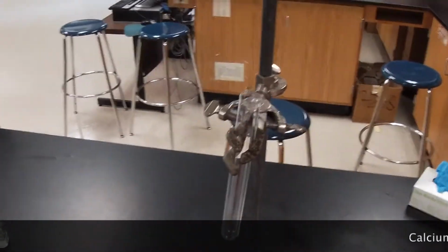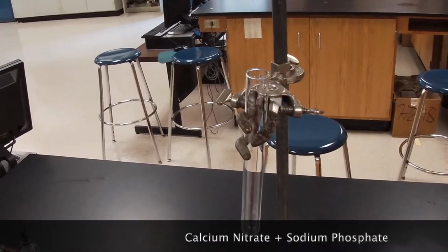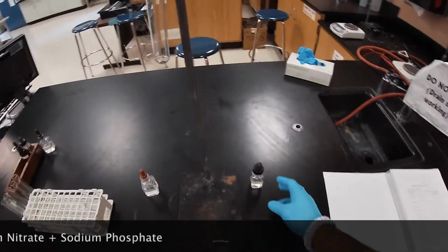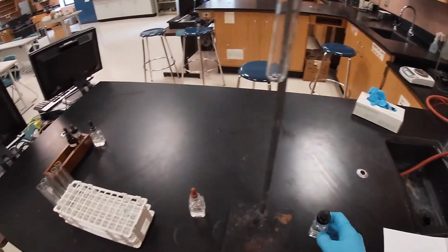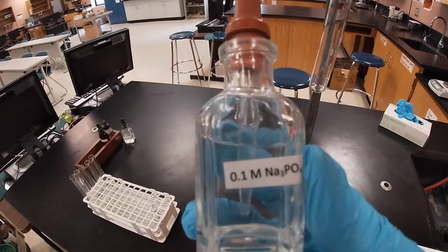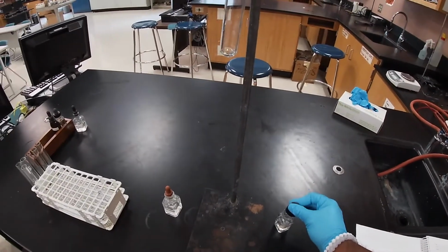For our next reaction, we're going to do our setup again. We're going to get a brand new test tube, and then react the last reaction, which is calcium nitrate, which is right there, with some sodium phosphate, 0.1 molar solution. We're going to start with the calcium nitrate.